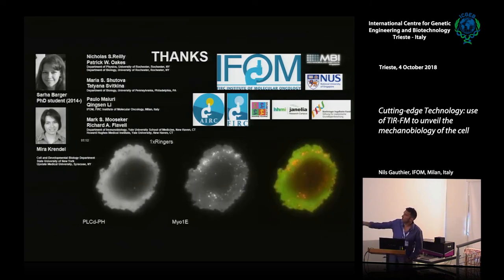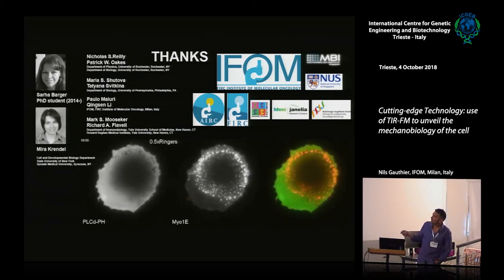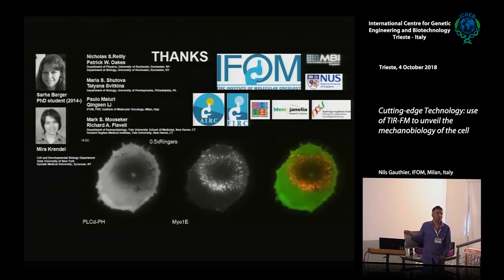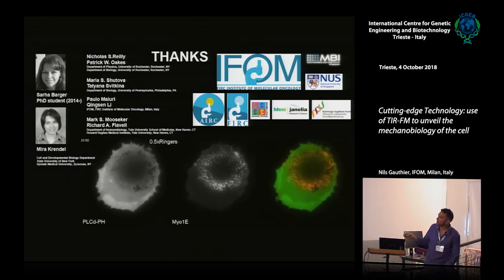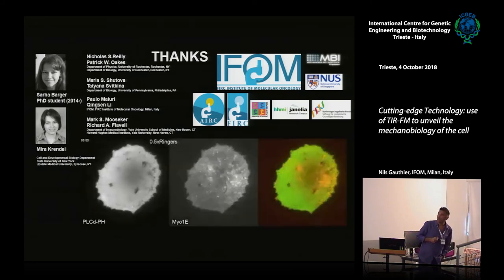And finally, I put this movie here, in case you have a question, where by playing with membrane mechanics, you see we can control these myosin 1E adhesions. While it was not the focus of this work, you can see the membrane lifting very well here around the adhesion as we play with membrane mechanics.